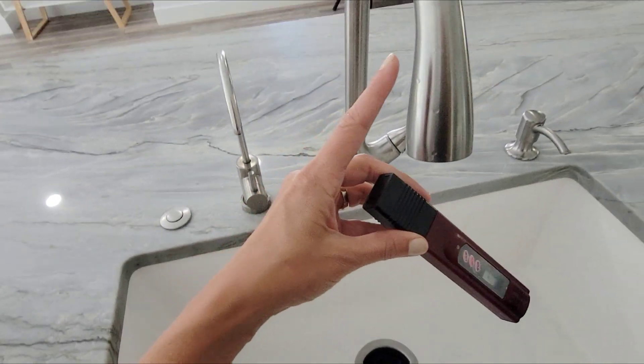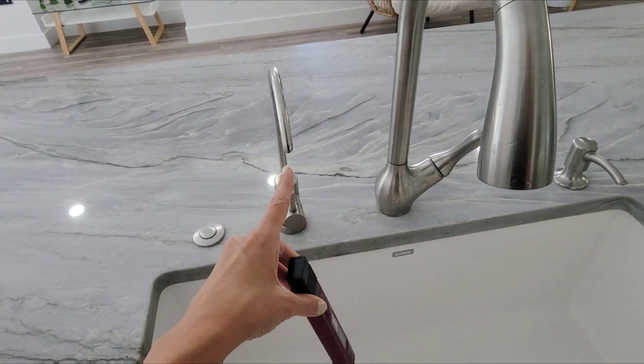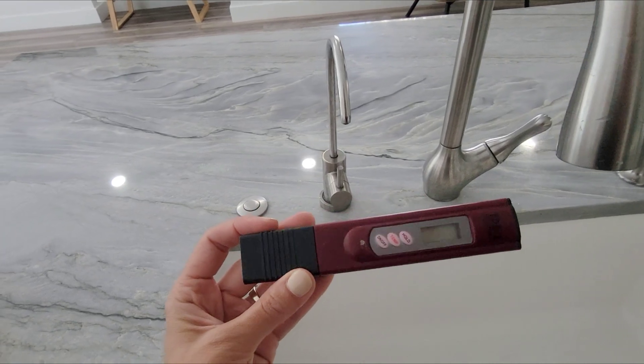Okay, let's test the faucet water and then the filter water with this water tester. See the difference.